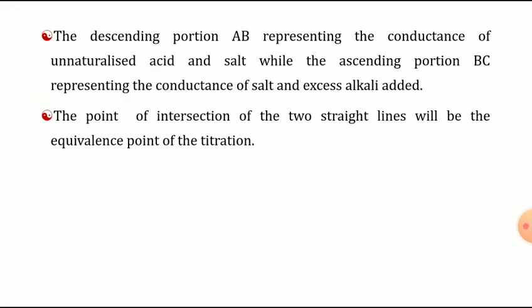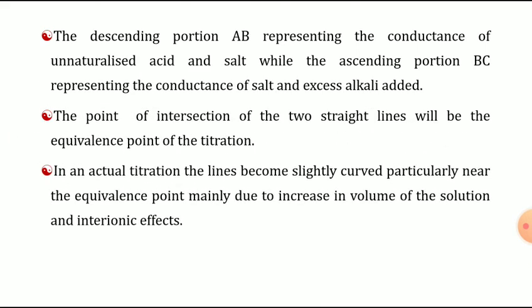The point of intersection of the two straight lines will be the equivalence point of the titration. In an actual titration, the lines become slightly curved, particularly near the equivalence point, mainly due to the increase in volume of the solution and interionic effects.